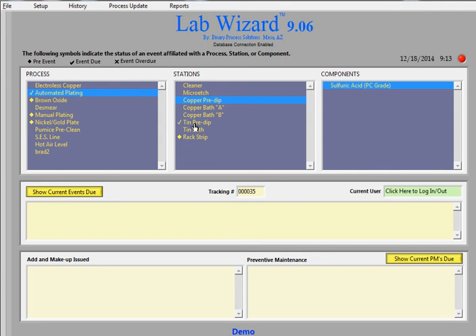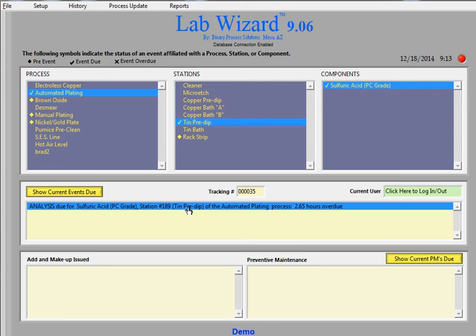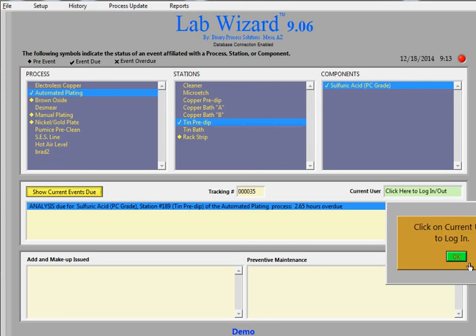So for instance, right here, we click on 10 prep dip. That's due for analysis. I'm going to go to this. I'm going to go to here. And once again, make sure we're logged in.